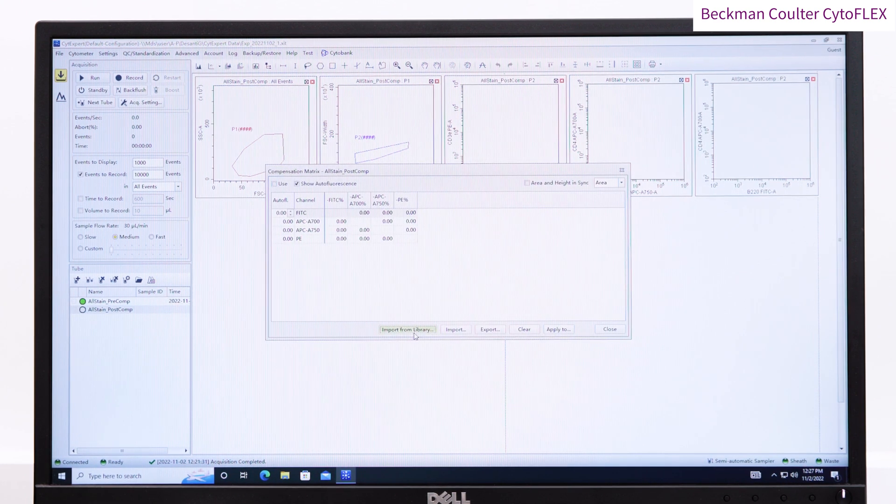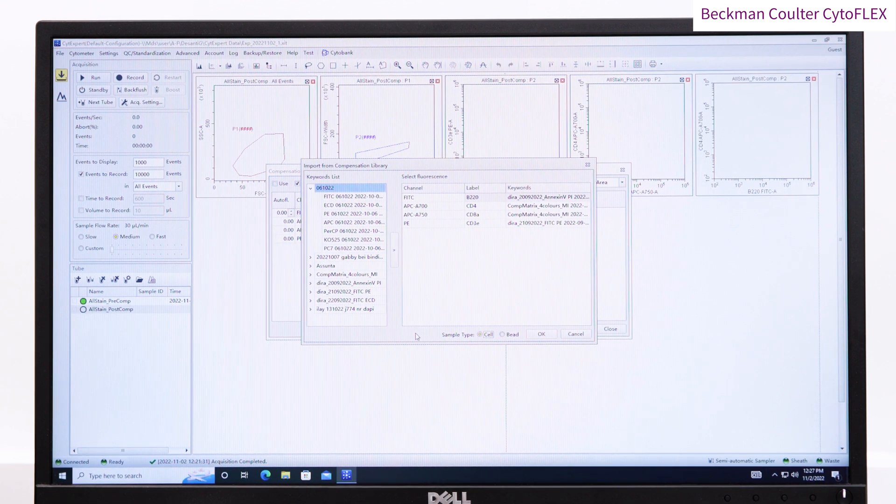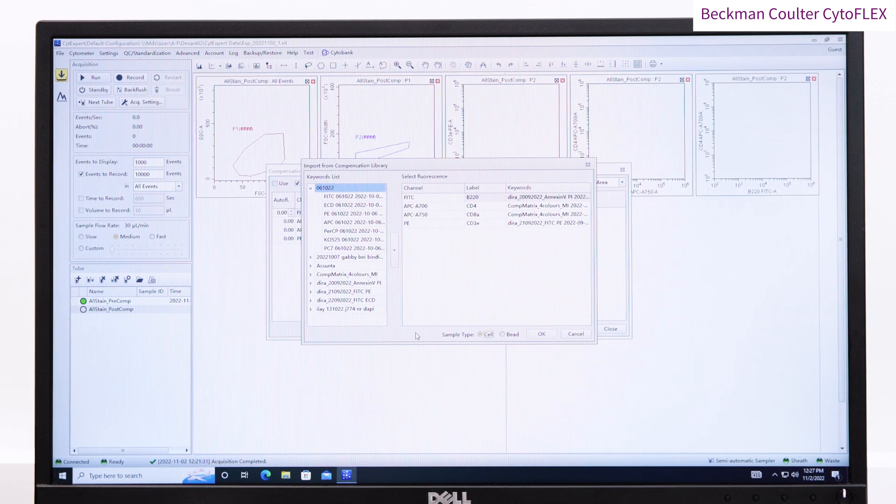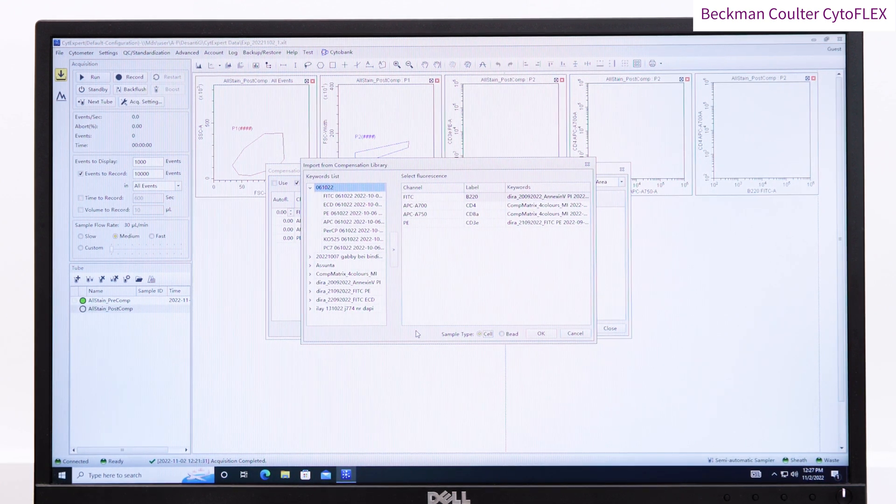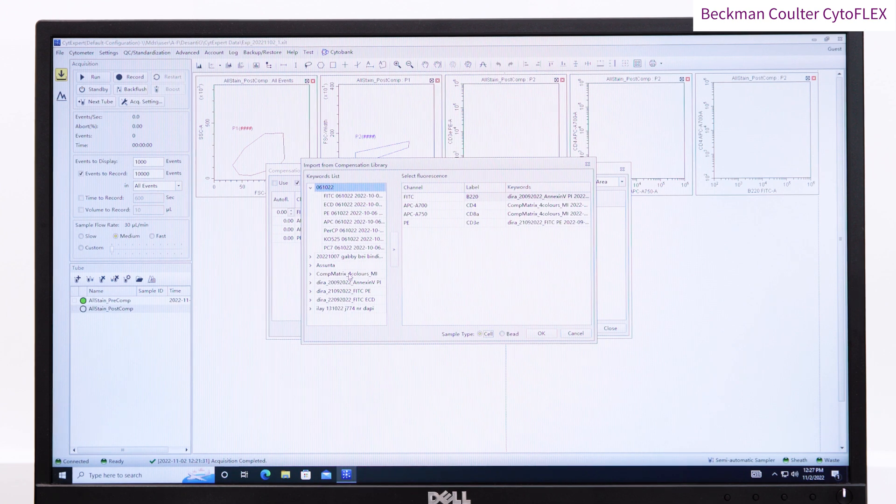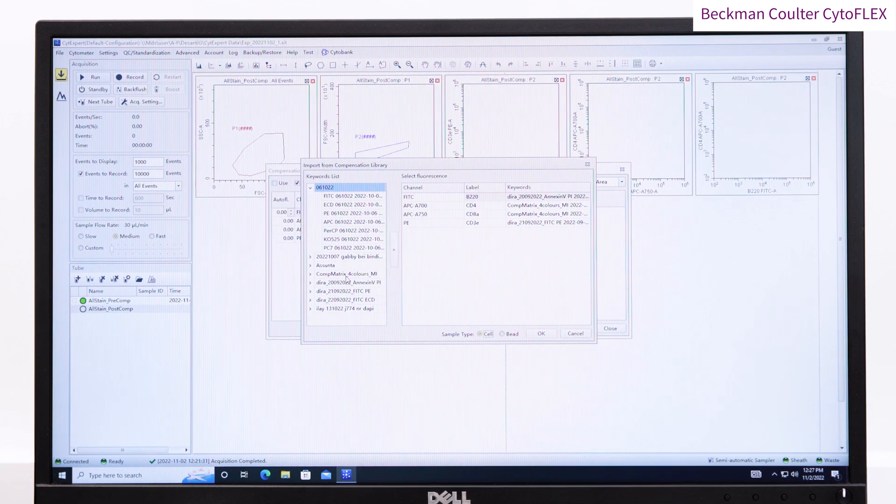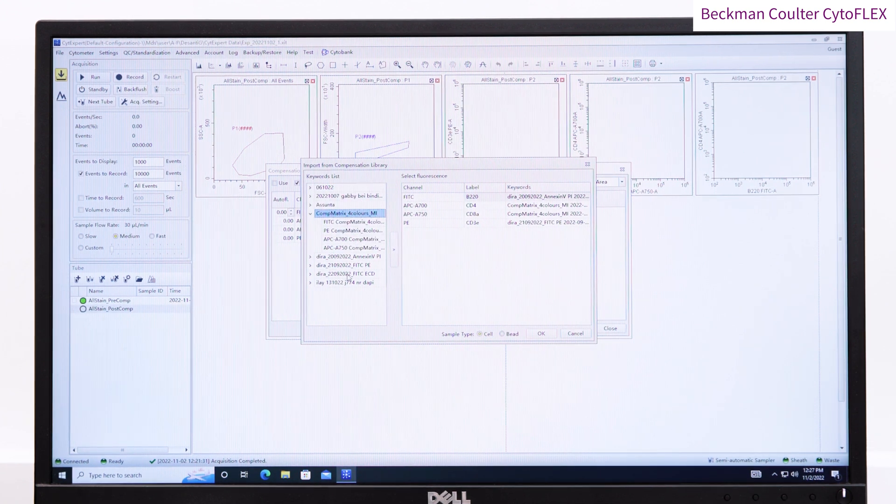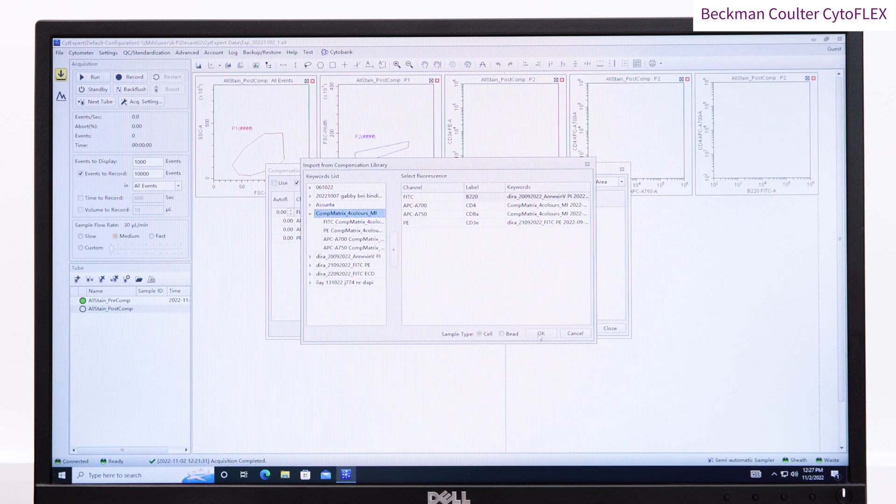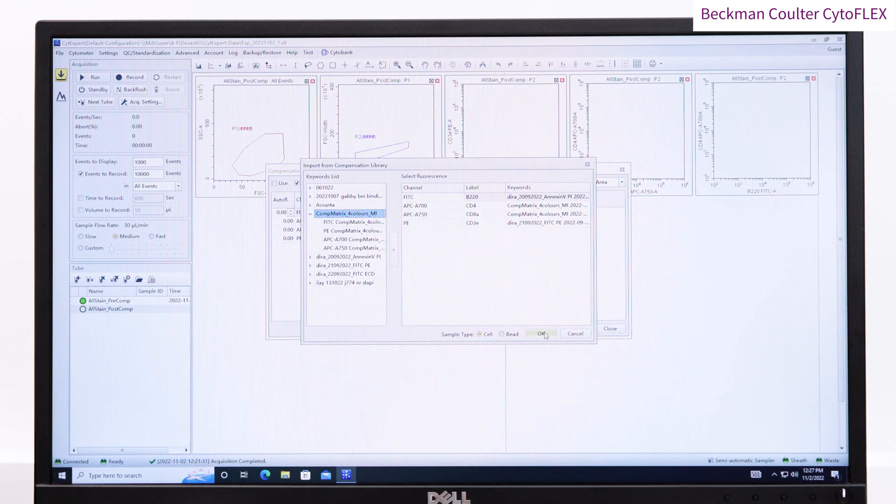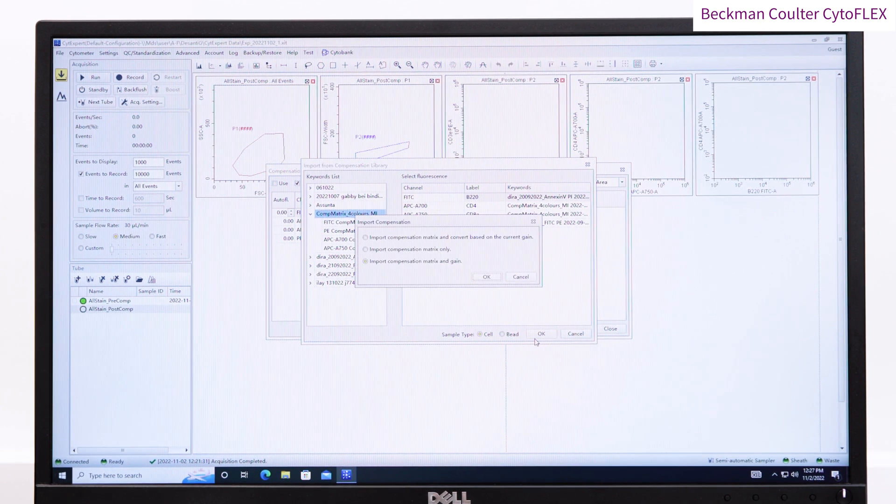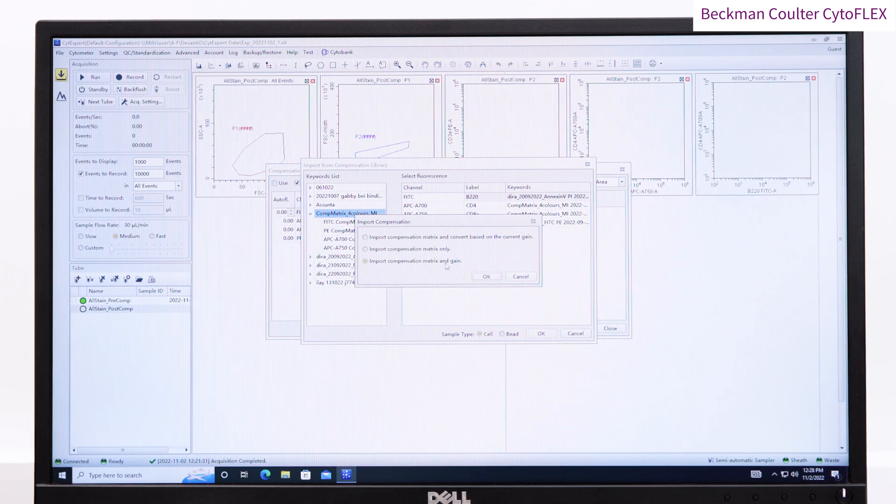You are prompted with some import options for whether you want to import the matrix alone, or with the gain from the compensation file, or whether you want to correct the compensation to the gains used in your experiment. If you had previously adjusted the gains in your experiment, then choose import compensation and convert based on current gains. Here we're going to use the matrix gains.